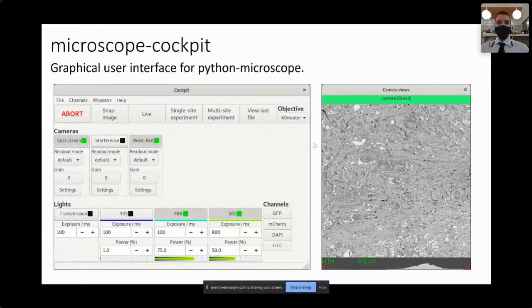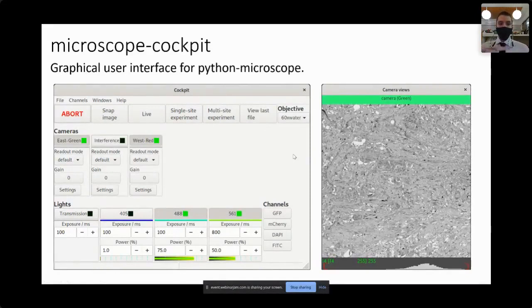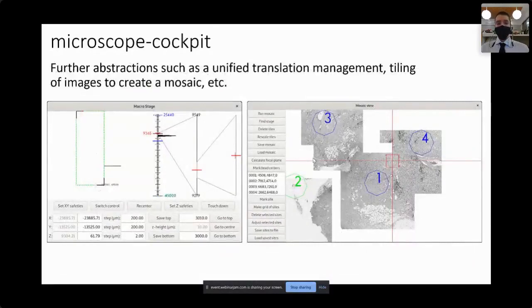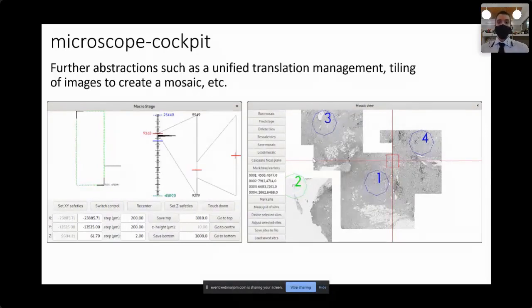On top of the Python Microscope package, you can add Microscope Cockpit, which is the graphical user interface part. By default it has a main window on the left and a camera view on the right showing an image from one of the cameras. Microscope Cockpit also provides further abstractions such as unified translation management to operate stages of various complexity — x only, x and y, x, y and z, or multiple z stages. It also enables tiling of images to create mosaics.